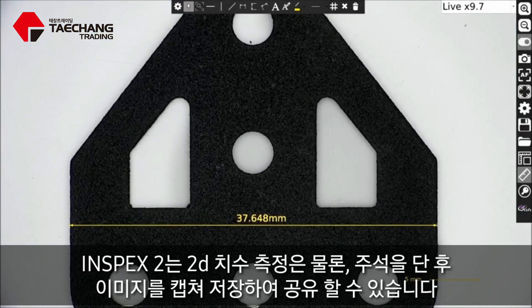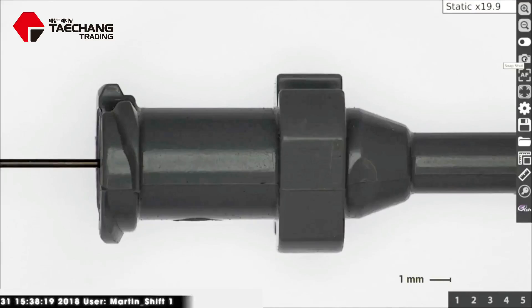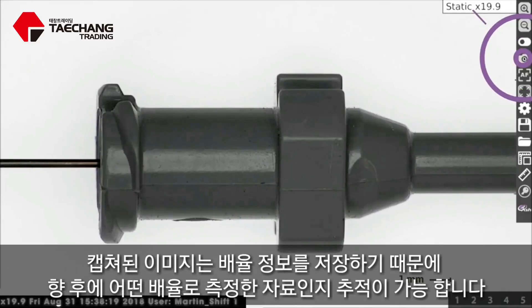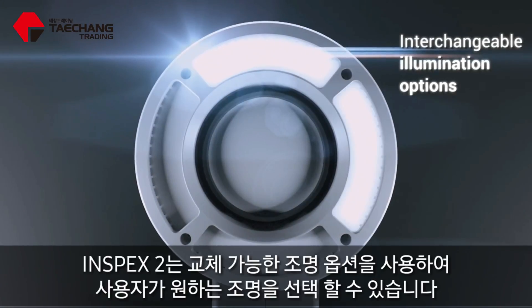2D point-to-point precision line measurements and annotations can be captured on images for qualification and documentation. On-screen overlays enable the go/no-go rapid inspection of samples. Image stamping with time, date, user, and magnification level allows for traceability throughout your inspection process. The Inspects 2 is complete with interchangeable illumination options.